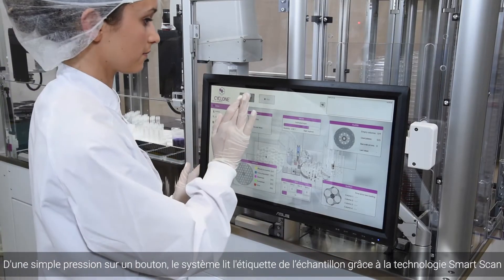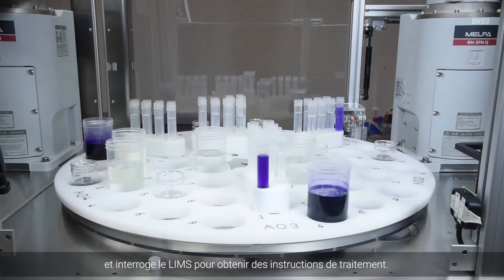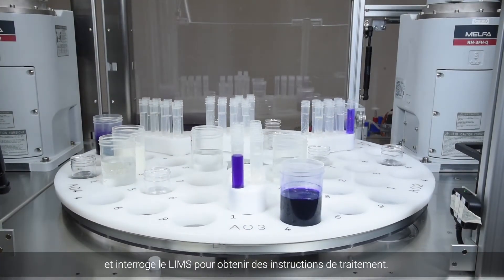With the simple press of a button, the system reads the sample label using smart scan technology and queries the LIMS for processing instructions.